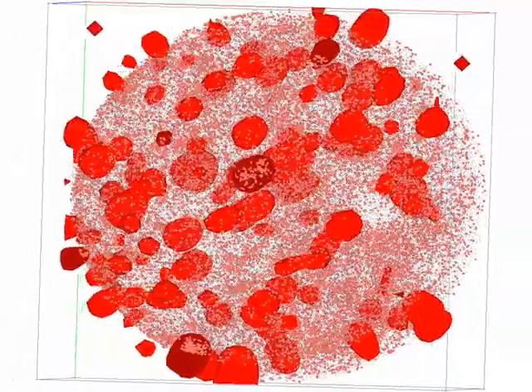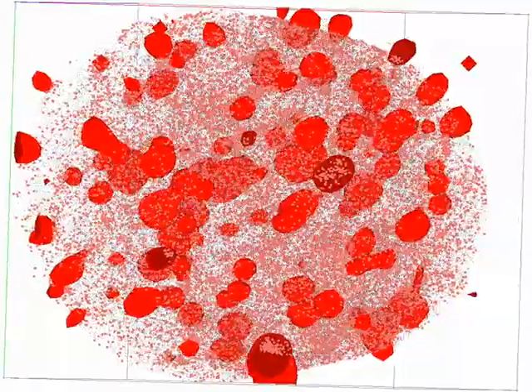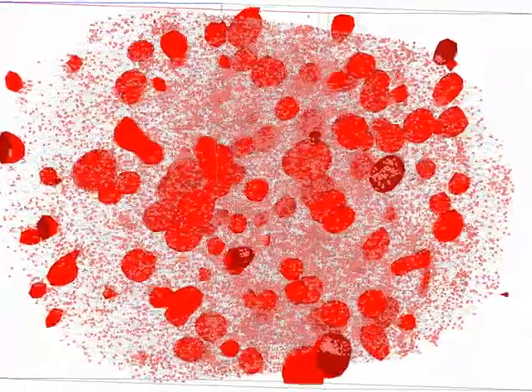It's darker because we're looking inside the precipitate, and you can see the larger copper atoms inside those shells.